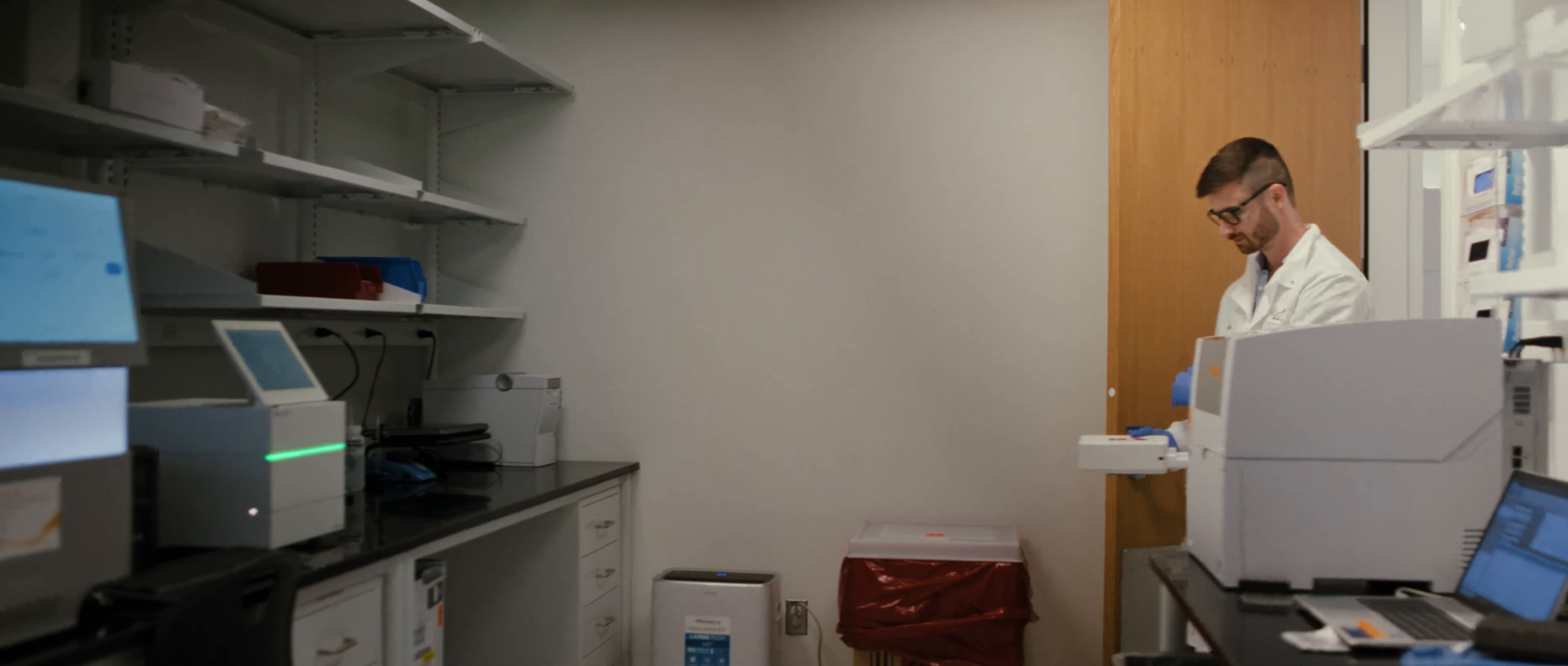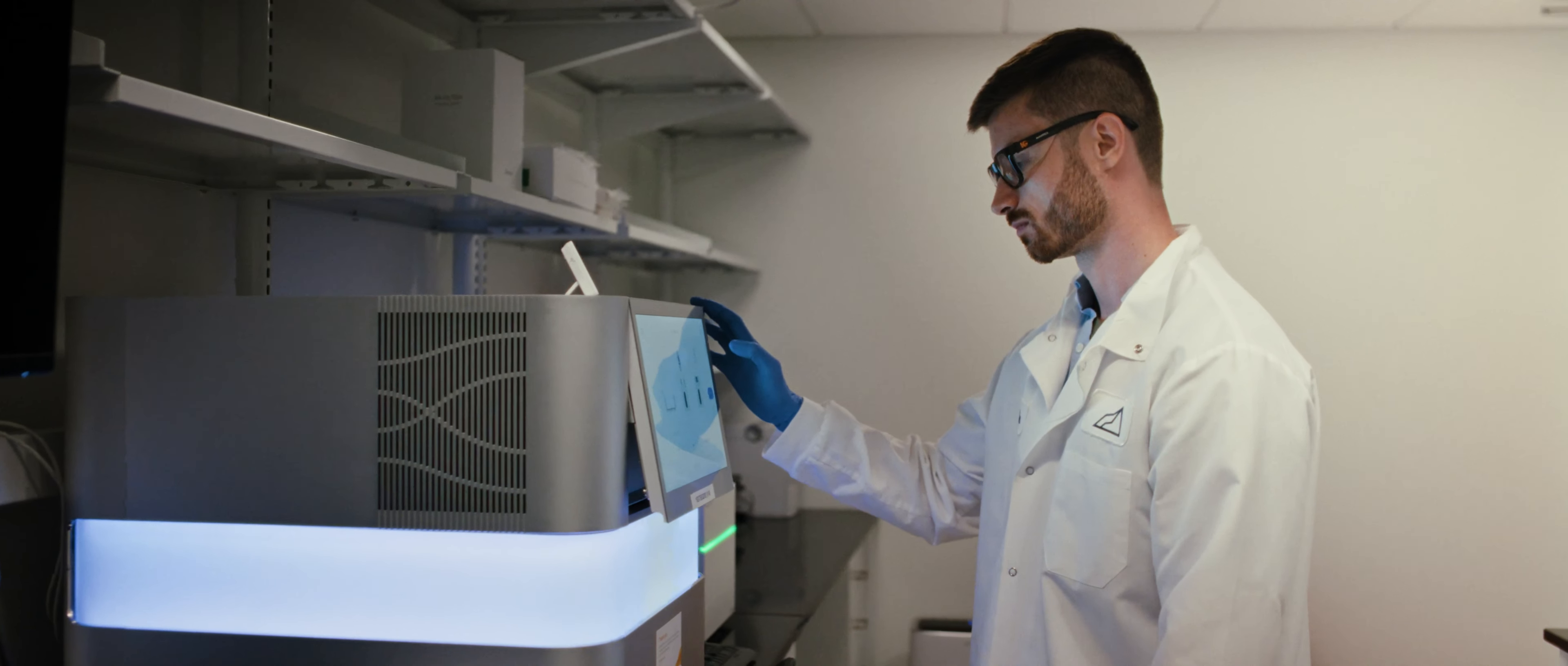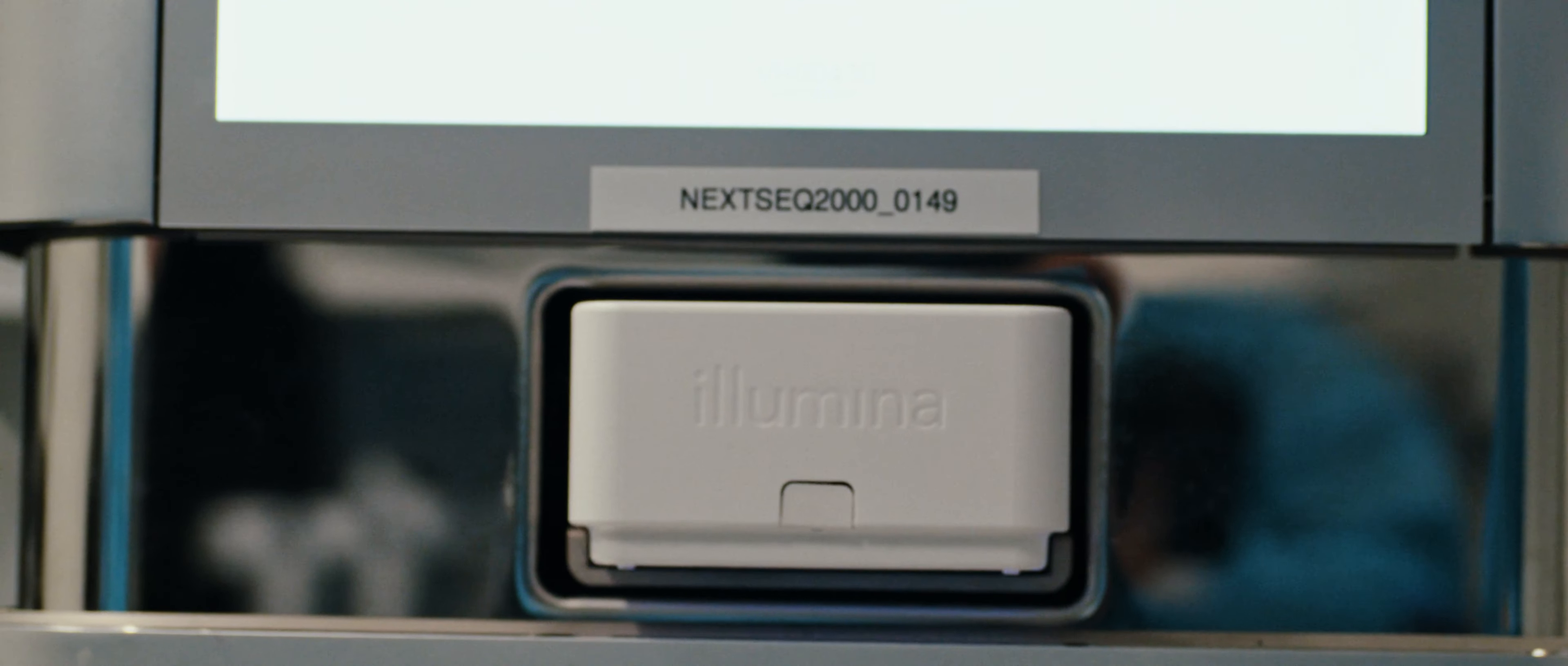Illumina technology enables us to read out the results of these experiments at a huge scale. And that means we can do hundreds of thousands or even millions of experiments in one batch. And that bandwidth, we can use it in all sorts of creative ways.